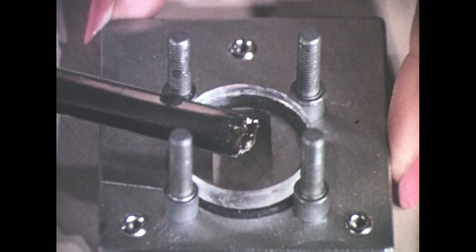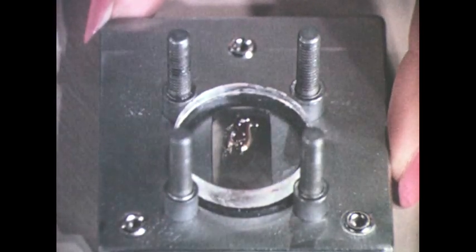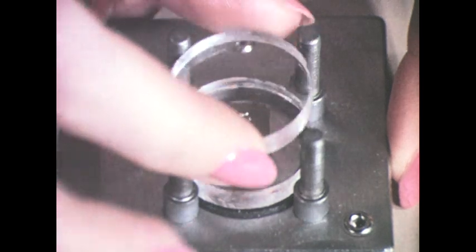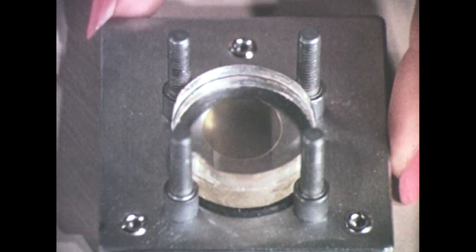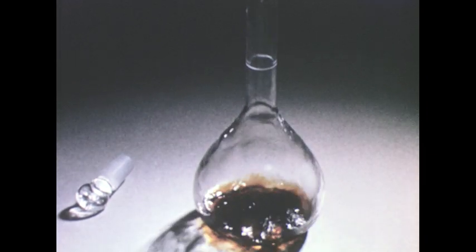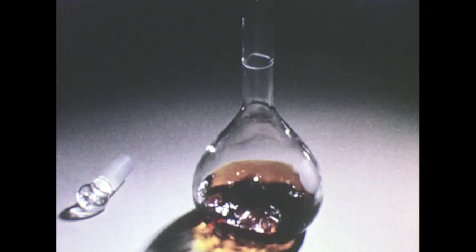Spectra of materials such as greases or waxes can be obtained by simply putting a thin film on the rock salt window. If a material is soluble in an organic solvent, it may be dissolved, placed in a sealed cell, and the spectrum obtained.